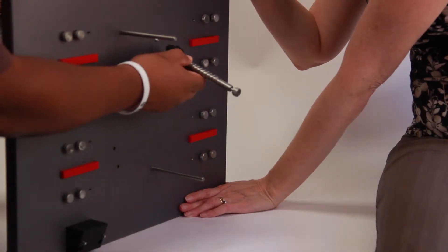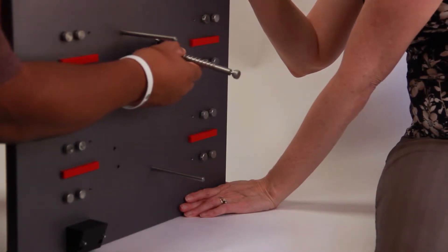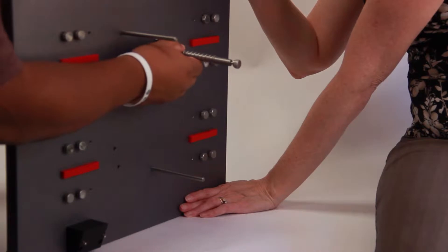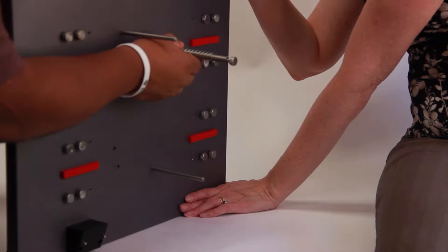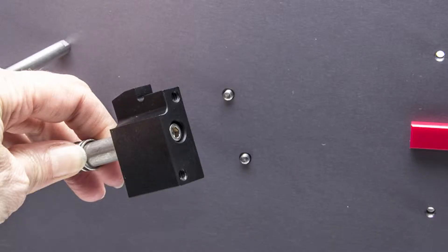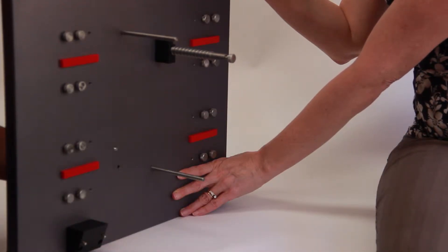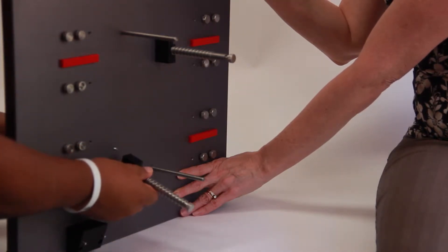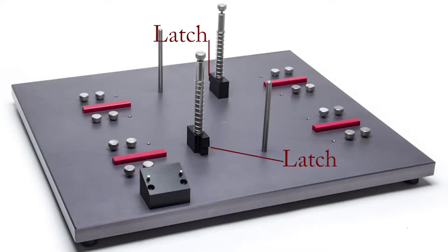While a friend holds the base plate, insert two cuvette post screws through the back side of the base plate into the cuvette mounting post holes. The cuvette mounting post latches should face to the front and rear of the base plate. Align the screw holes on the cuvette mounting post with the holes on the base plate. Install the second cuvette mounting post in similar fashion. Be sure that the cuvette latches do not point toward the center of the base plate when they are installed.